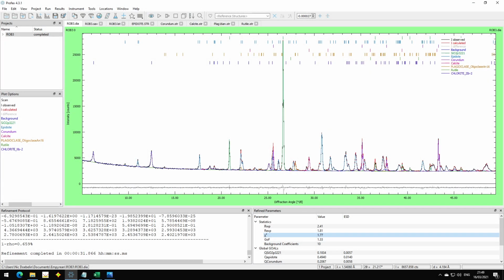That was an interesting example because it allowed us to compare the refinement results with the XRF data. Big thank you to the user who provided this data, and also the information on the Empyrean instrument, the pictures we used in the first part of this tutorial.